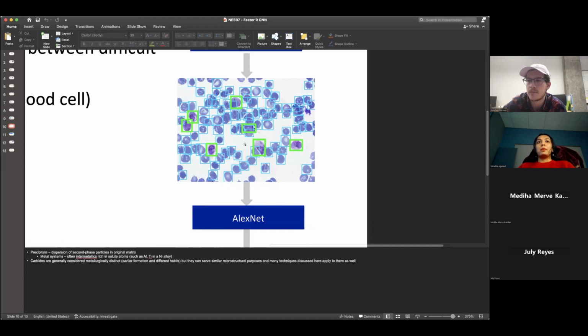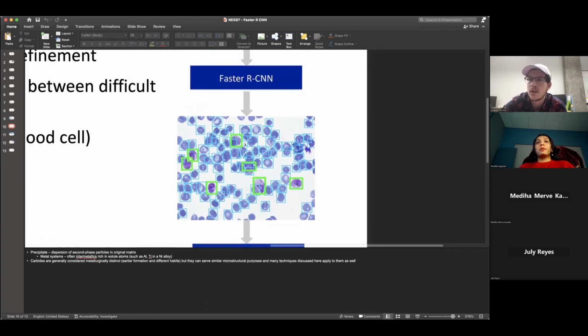Okay. Now you use the term selective search algorithm multiple times. Yeah. But I never understood what the selective search algorithm is, because it was replaced by RPN. Yeah. So I think in faster RCNN, they replaced it by RPN. Yep. So what is the classic difference between selective search and RPN? To my best understanding, selective search isn't a convolutional neural network based bounding box algorithm.